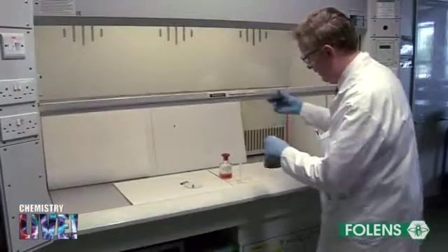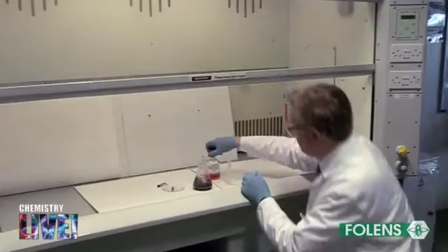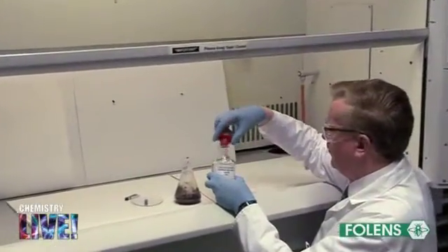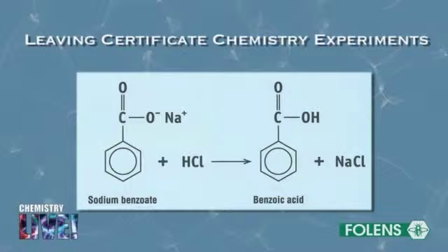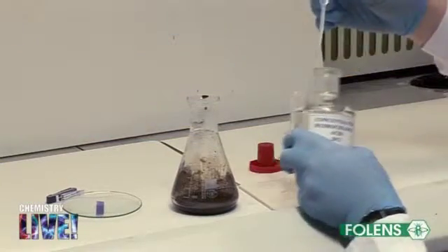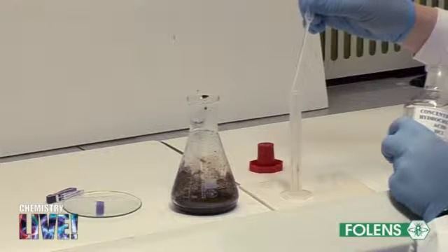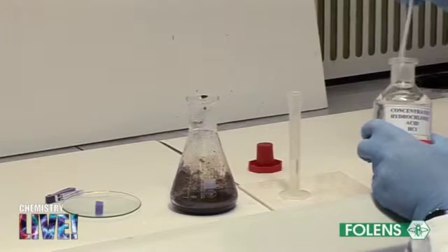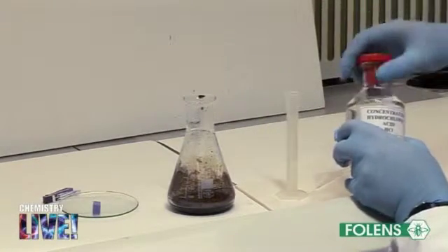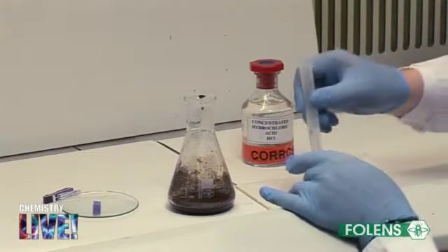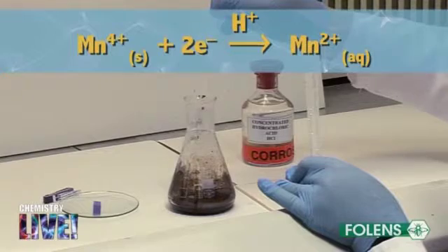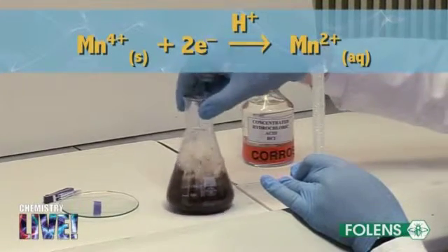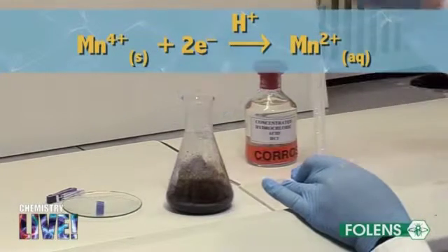In the fume cupboard, 4 cm³ of concentrated hydrochloric acid is added drop by drop to acidify the solution. Gloves are worn to ensure that the acidic solution does not come into contact with the skin. It is necessary to add concentrated hydrochloric acid in order to convert sodium benzoate to benzoic acid. Since benzoic acid is only slightly soluble in cold water, this helps to precipitate out the benzoic acid. In addition, the hydrochloric acid neutralises any excess sodium carbonate and the potassium hydroxide produced in the reaction. The third reason for adding the hydrochloric acid is to provide an acidic medium to enable the Mn⁴⁺ ions in the manganese dioxide to be reduced to soluble Mn²⁺ ions.